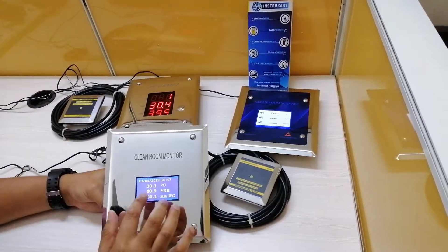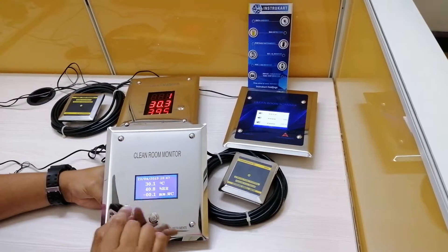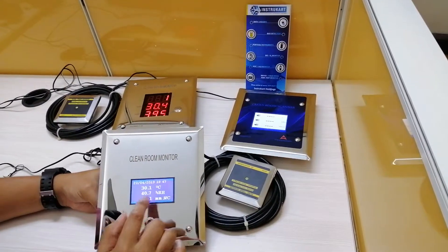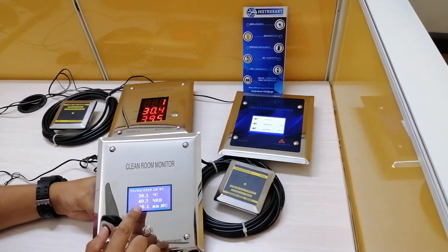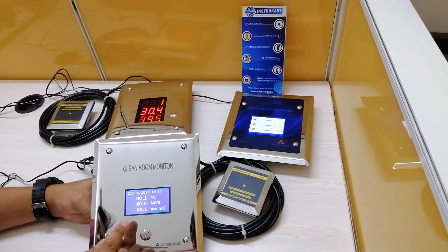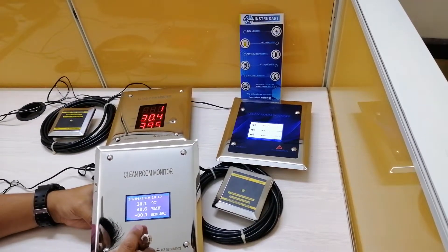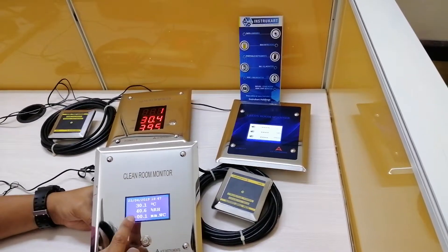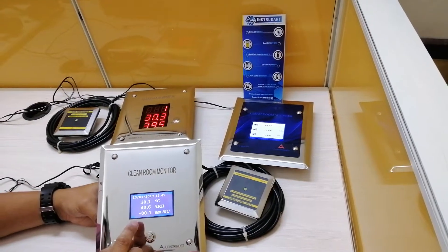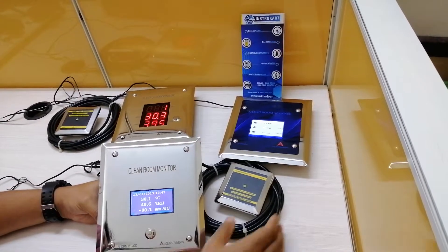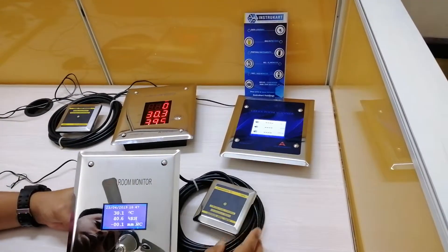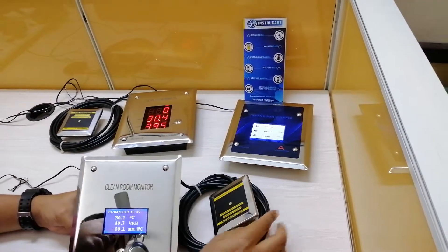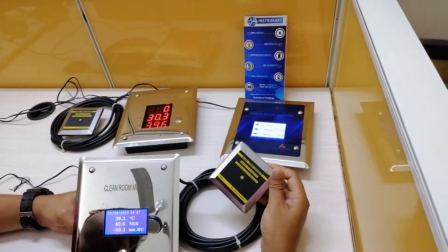The LCD front screen displays the date and time along with temperature, humidity, and differential pressure readings as you can see. It also has a process violation alert on the screen itself if there is a violation. It uses external sensors, so you can see there is an external sensor for humidity and temperature, and the differential pressure sensor stays here.